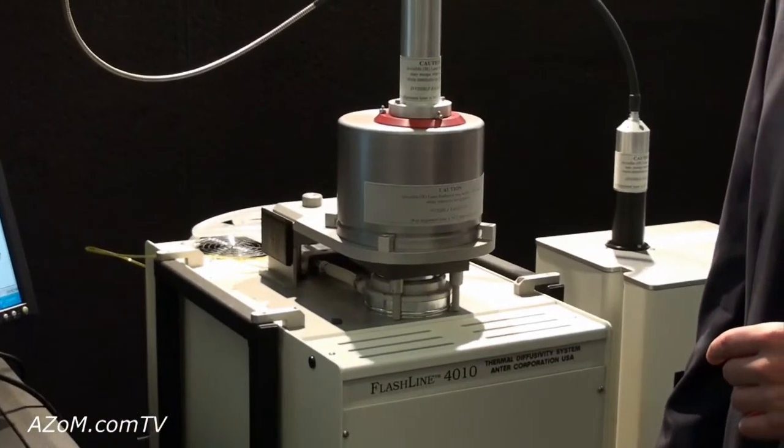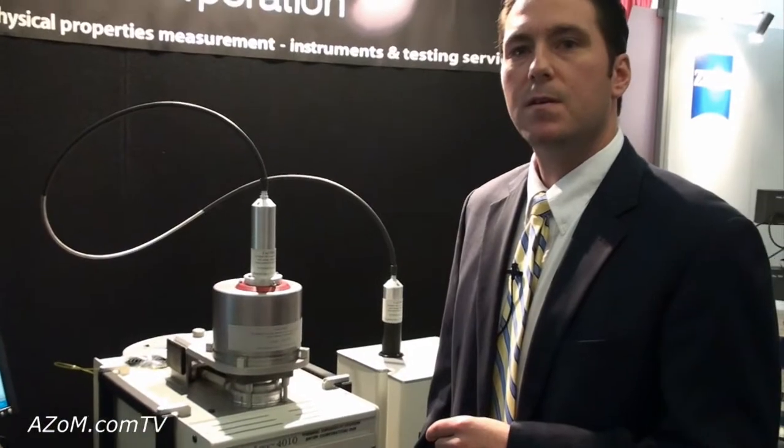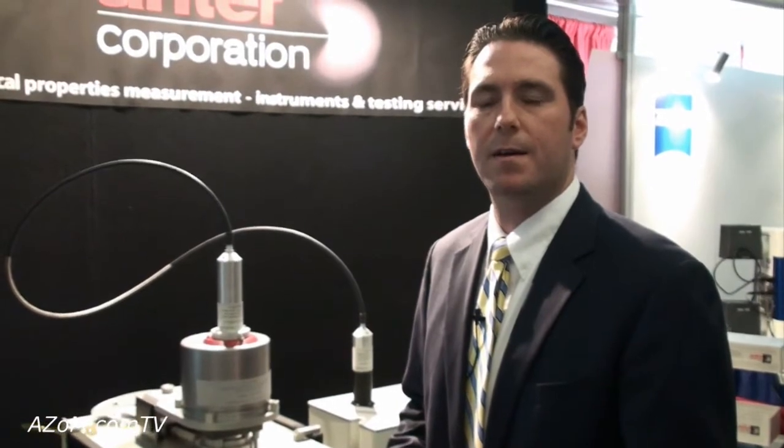And if anybody wants any more information on this one or wants to see any other instruments, where can they go to find that? They can go to www.anter.com. That's A-N-T-E-R.com. Thanks very much for telling us about the Flashline 4010.